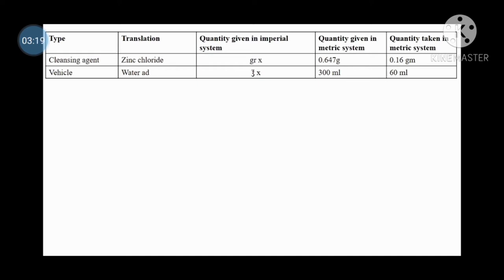Water which is used as a vehicle. Quantity given in Empirical System that is up to 10 ounces. That 10 ounces is nothing but 300 ml. So that is Quantity given in Metric System 300 ml. Quantity taken in Metric System 60 ml.